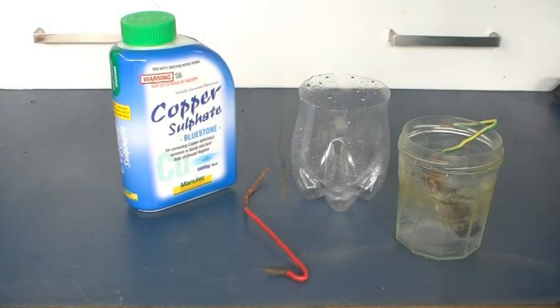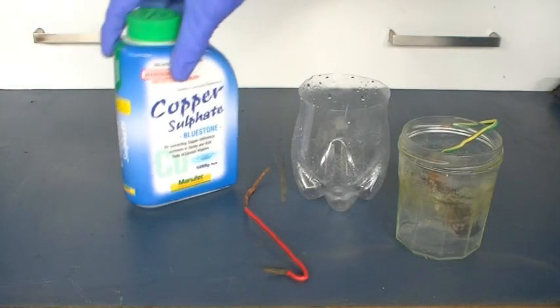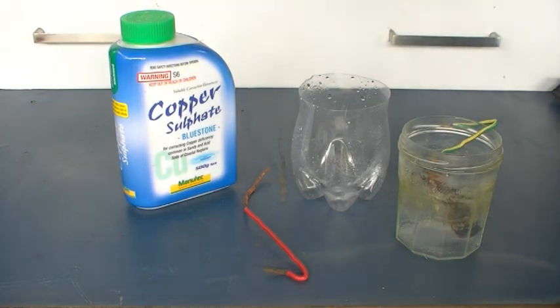Alright, so to get this done we're going to be electrolyzing a copper sulfate solution. The copper sulfate will provide sulfate ions, and we'll be replacing the copper ions with hydrogen ions to create sulfuric acid.